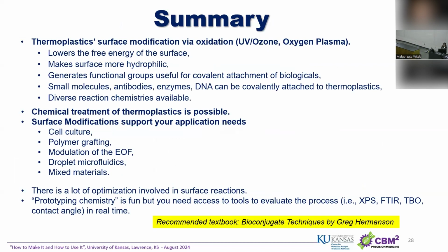So in summary, you really need to be aware of what you want from your surface, because designing and activating and modifying thermoplastics is fun, but it takes time.